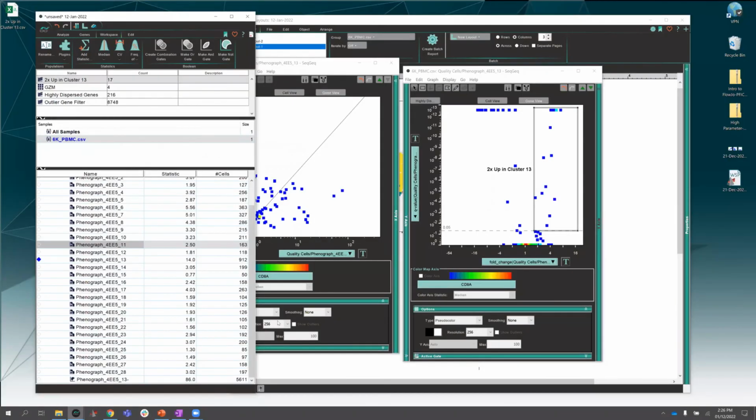And there are other platforms that way. You can also hit your cluster and do an enrichment test. And if you have gene sets you've imported, some of them are included in the demo data, you can import that gene set, run it, and it'll give you a similar analysis.